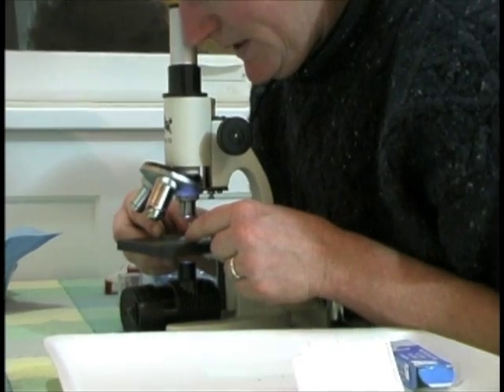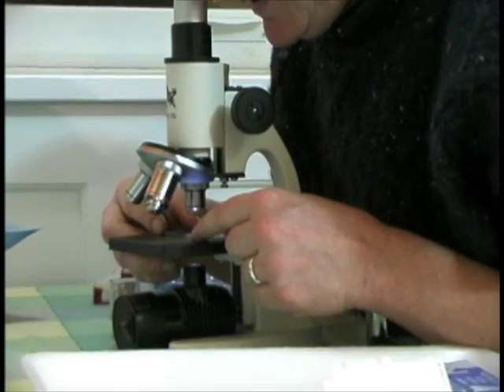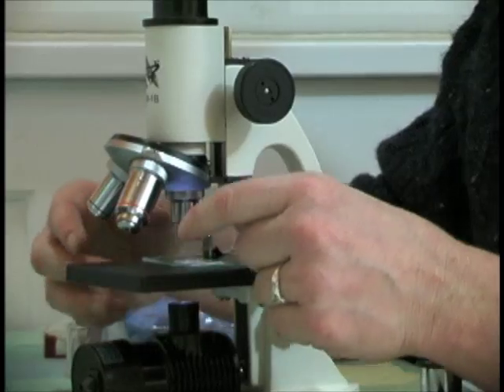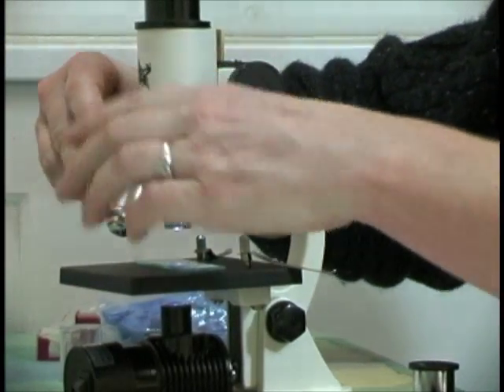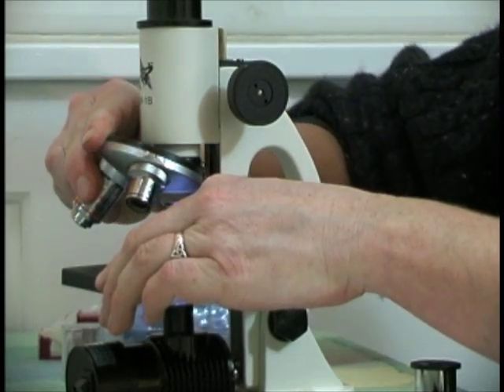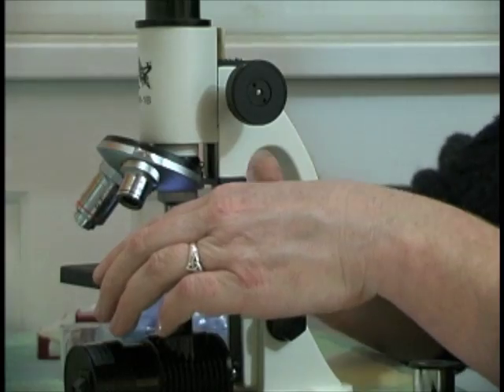I want to look at the pointy end of the root because that's where the meristem is — where all the mitosis will be going on. Now I want to move to the next higher power so I can see mitosis in more detail.